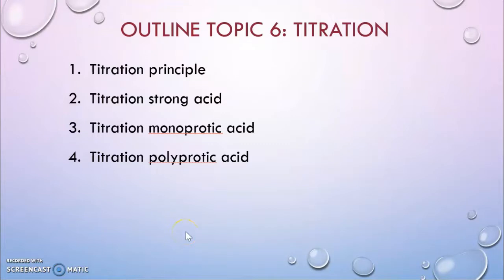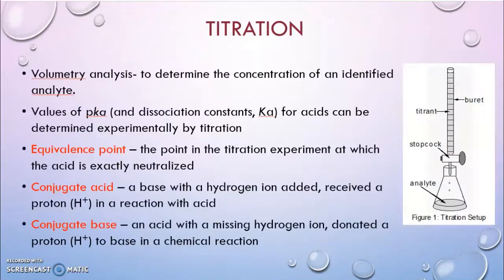The outline of this chapter will be on titration principle, titration of strong acid, titration of monoprotic acid, and titration of polyprotic acid. Before we look at the principle or the theory behind titration, we shall look at the experiment setup for the titration, which is on laboratory number 3. The experimental setup for a titration experiment will look something like what is being shown in this diagram.